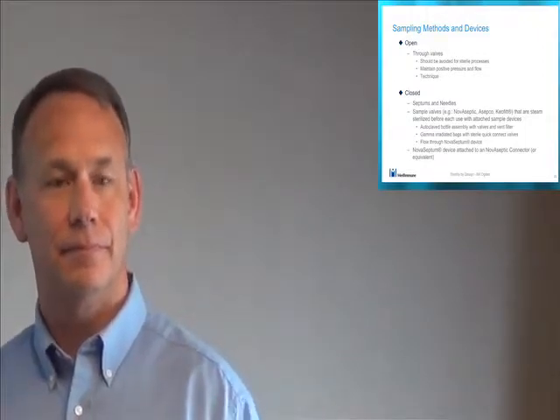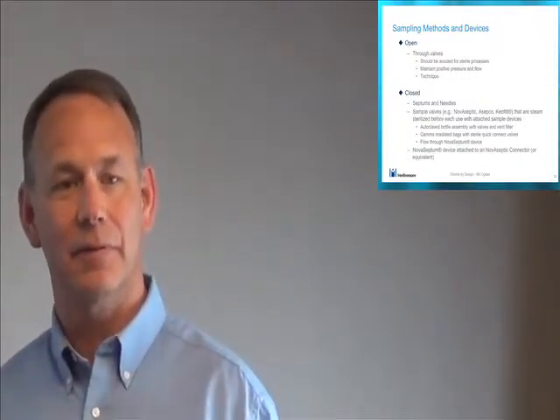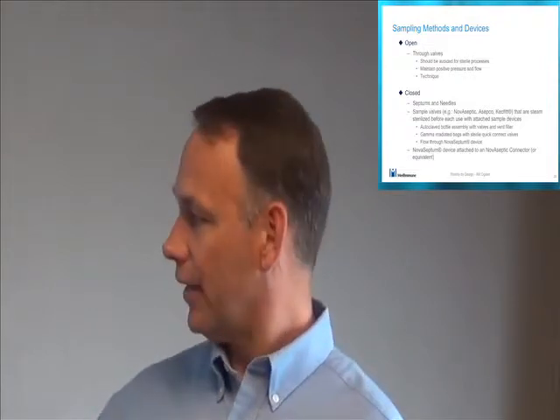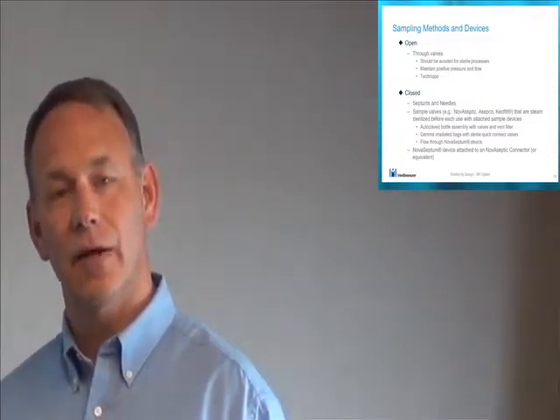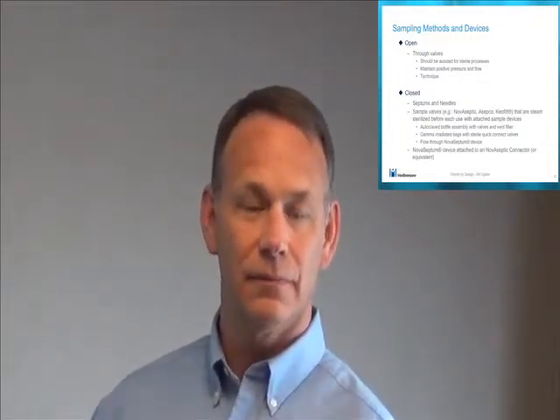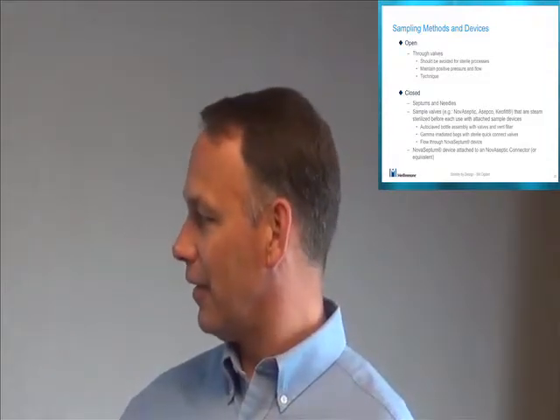We actually have that on our new bioreactors. I think it has up to like 12 bags. So you're probably talking about an NA Connect with a Nova Septum or something? It's the same thing, but basically you can take up to 12 samples without sterilizing anything. It fits the triclover on the bottom of the vessel, and you just pop it open, and then you crimp it off with a metal band on each sample bag. So you never have to sterilize; you sterilize that connection one time and that's it, with the fermenter. Yeah, and that would be the bottom one right here.